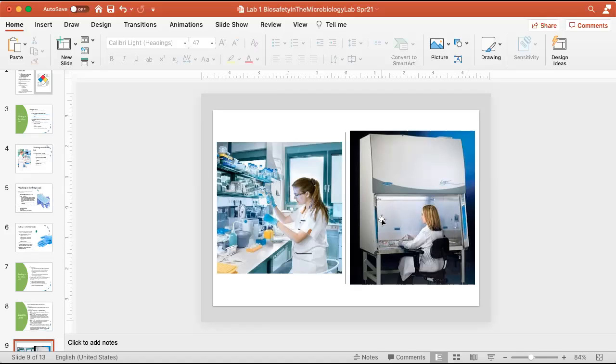So there's a glass door that comes down. You can see her hands are just through the crack under the door. And she's working on a surface that is kept clean, kept sterile with the use of air currents in here and ultraviolet light. Now she's doing something very naughty in this picture. Can anybody pick it up? What has she not done that she should do?